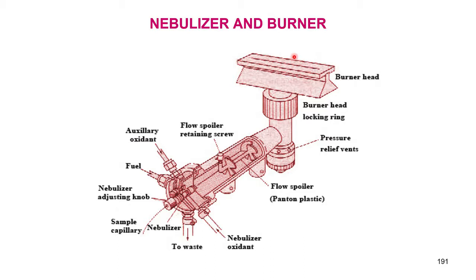But if I have fuel and oxidizer coming together, or I forget about this auxiliary oxidant, I just take this fuel and put it into the flame, and let all the air available around the flame compartment be used, just like in your LPG home. What happens?